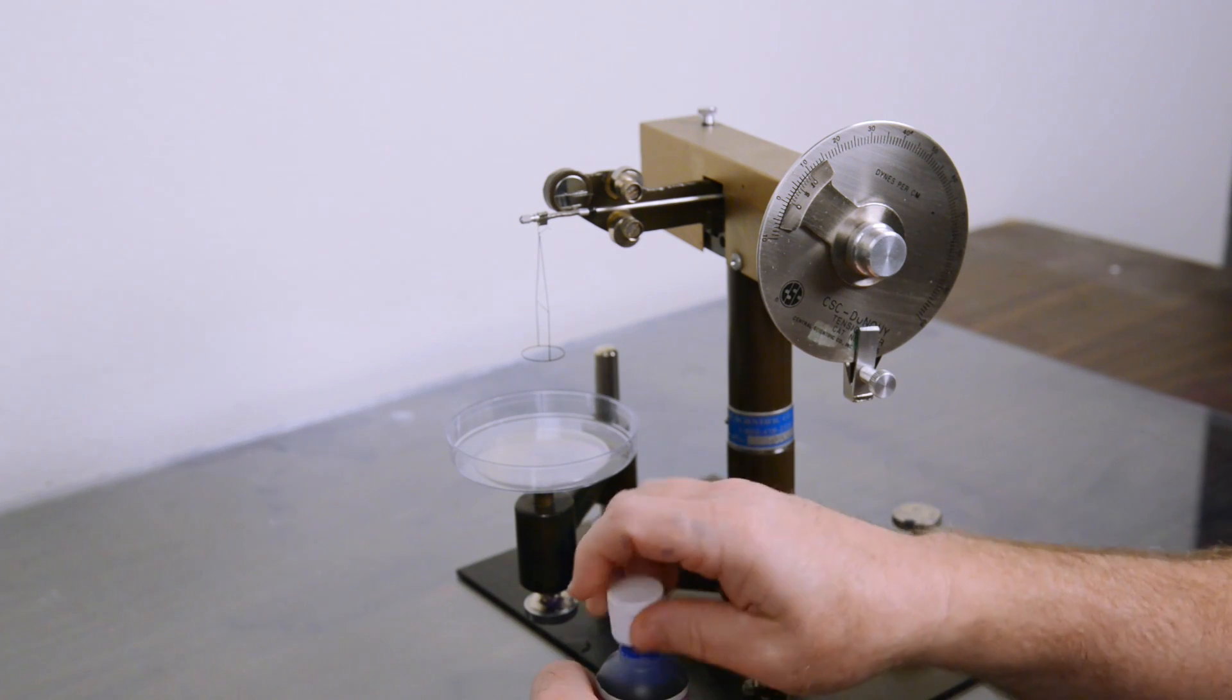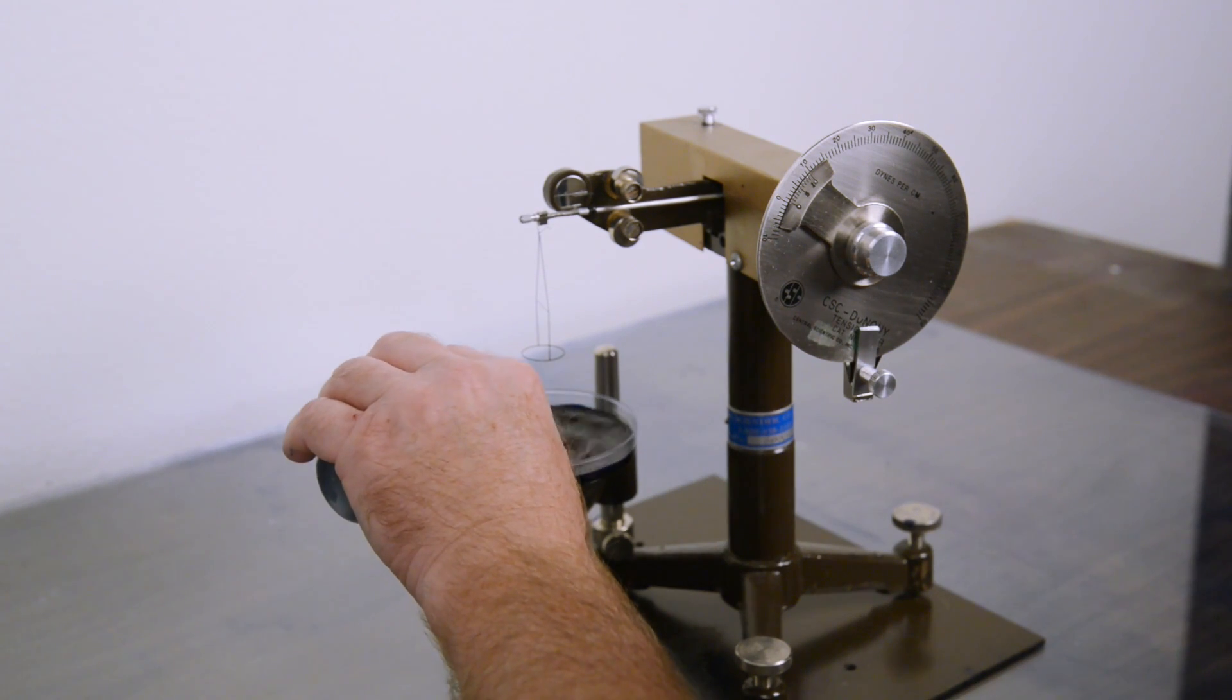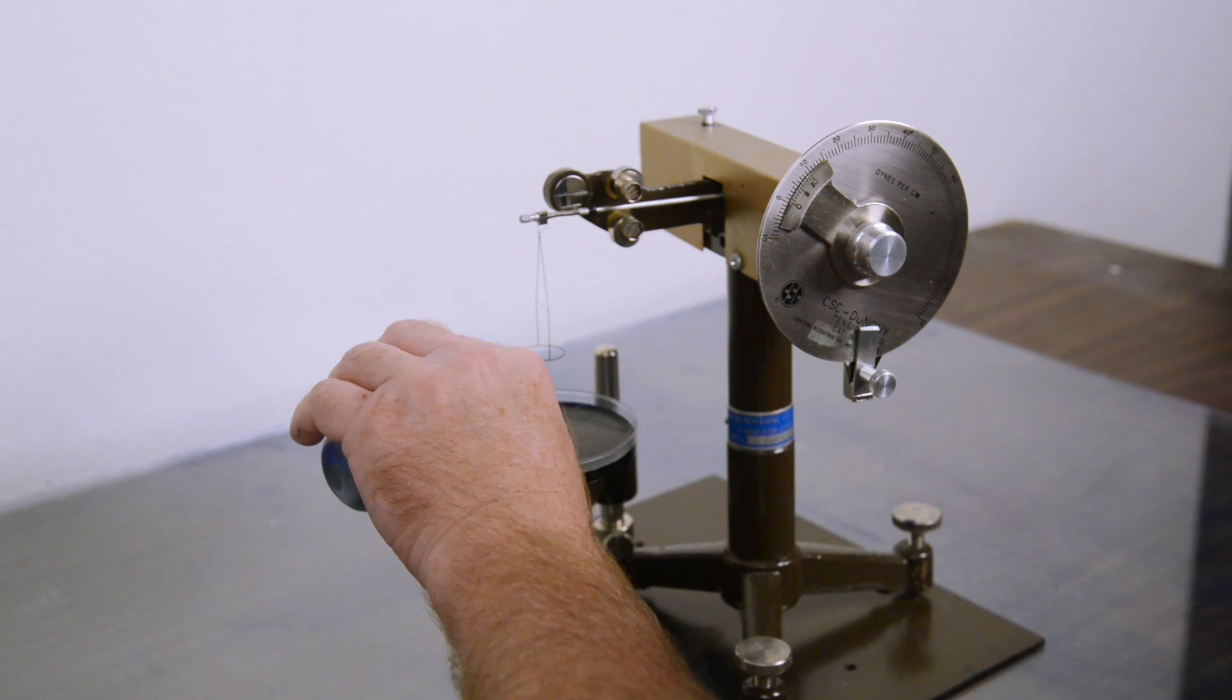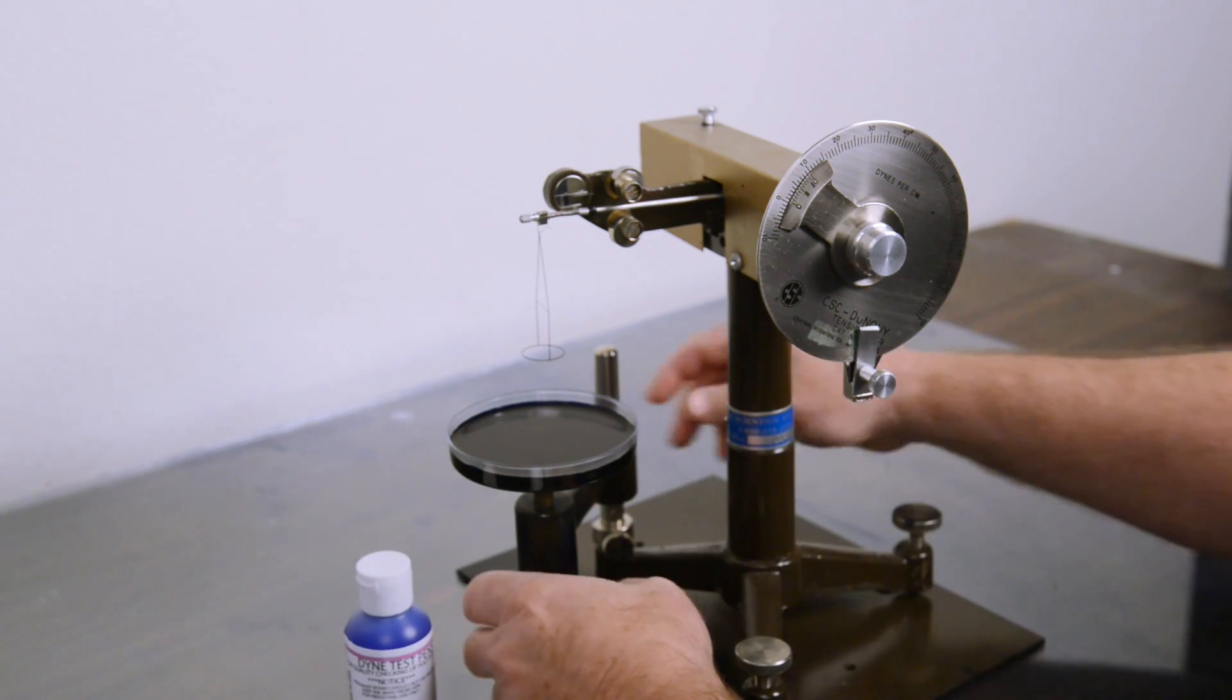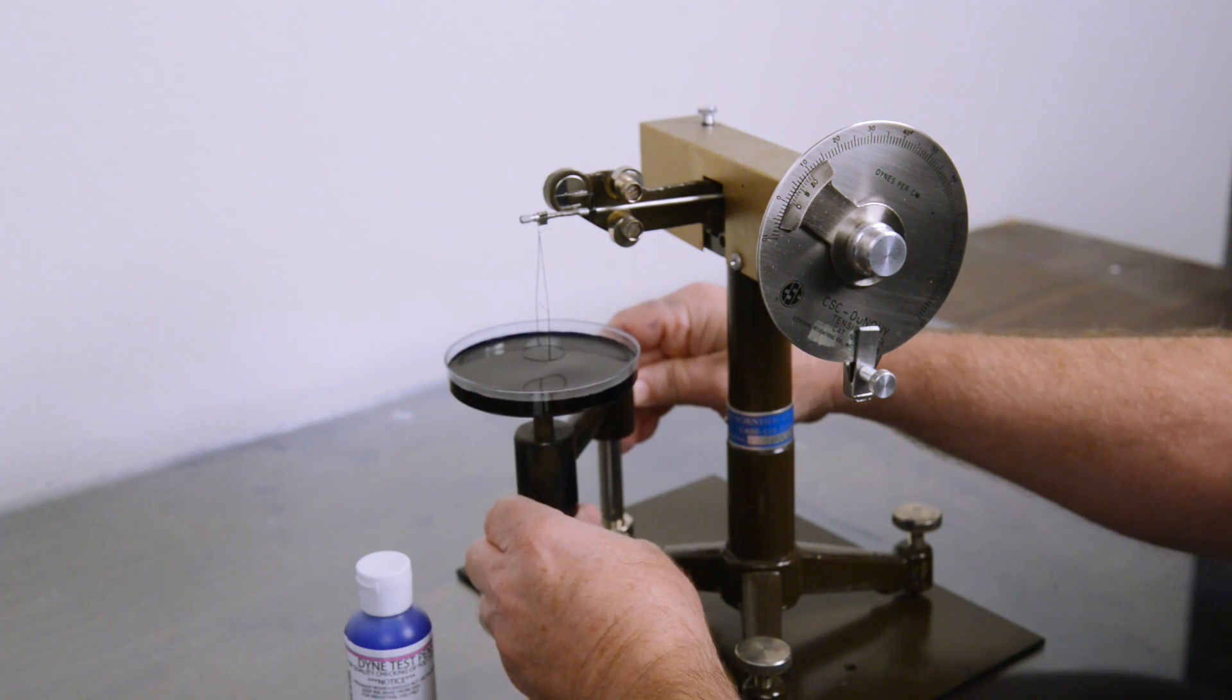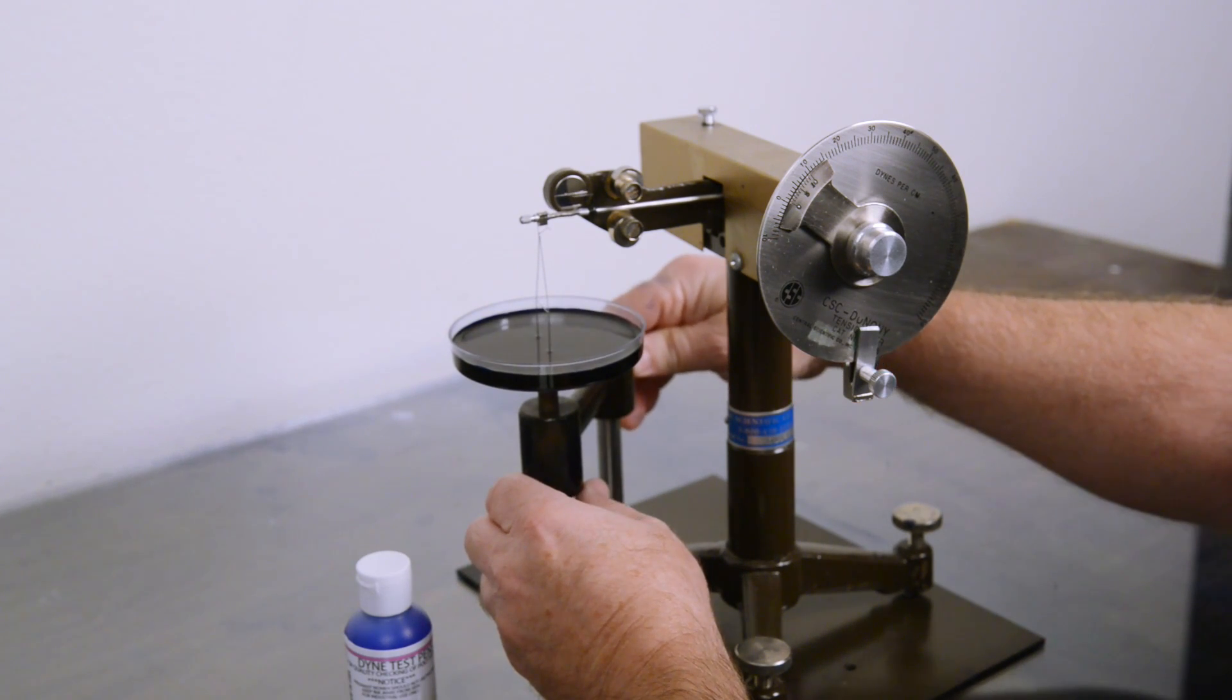We are going to pour the ink solution into the petri dish so it is just below the level line, put it aside, and adjust the arm so that the ring is just below the surface of the ink.